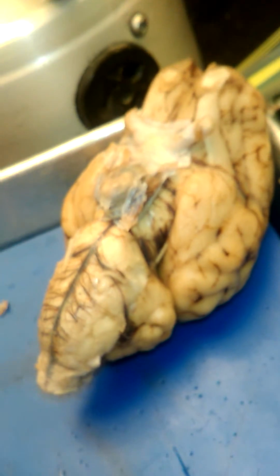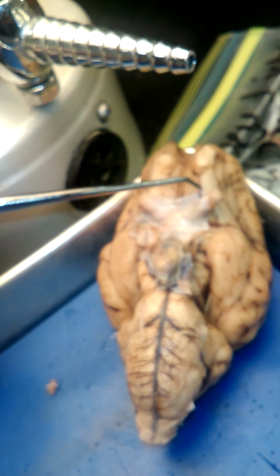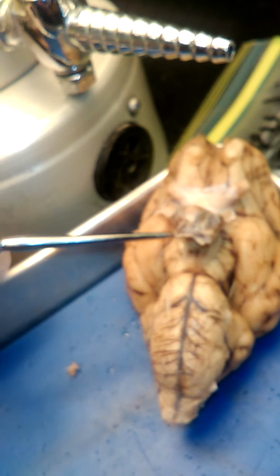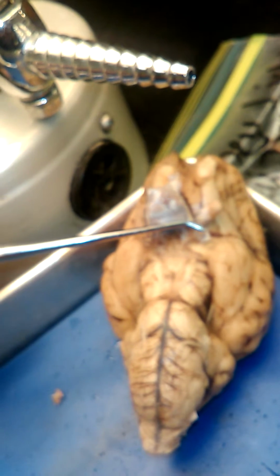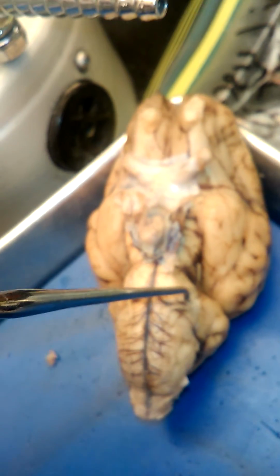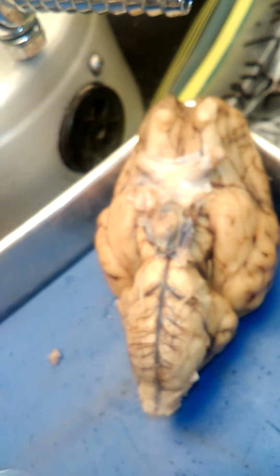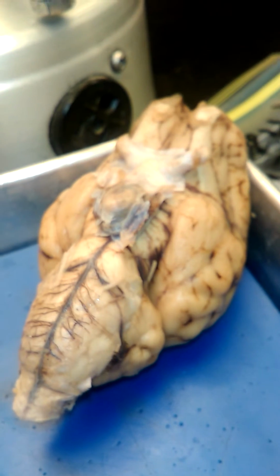So I just covered the 6 nerves that are visible on the sheep brain, which also are on the human brain, which is the olfactory nerve, the optic nerve. Underneath the pituitary gland is this nerve right here, as you can see, and it is called the oculomotor nerve. And then right here we have the trochlear nerve. And then the nerve that's been ripped right here in this area is called the trigeminal nerve. And then right here is the abducens nerve. So those are 6 nerves out of the 12 in the human brain that can be found in the sheep brain.